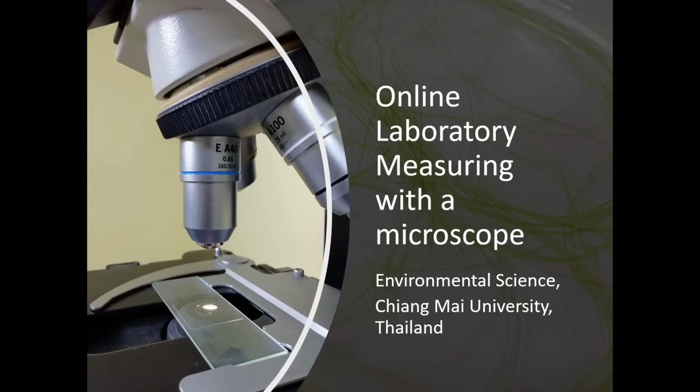Most of the objects needed to be viewed or examined under a microscope are not visible to the naked eye. Apart from the details which can be enlarged under a microscope, the size of microscopic objects can also be measured. Dimensions, including length, width, or diameter, are often useful characteristics in classification and identification of organisms.